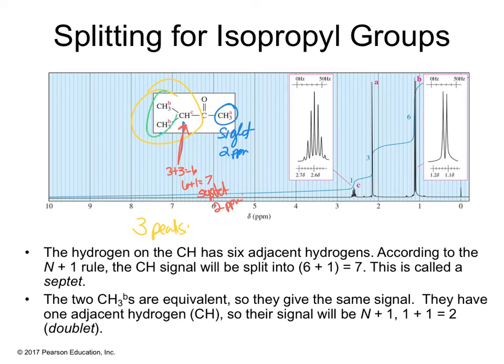And then you have these here, the B, and they're going to be a doublet. And they're going to show up at maybe 1.3 ppm. So they're in the least electronegative environment, so you're going to see those here. And you see that's about 1.3 ppm, and that's B. And there's 6 protons there, and it's showing you it's expanded here as a doublet. Is it a doublet? It should be a doublet, yes.